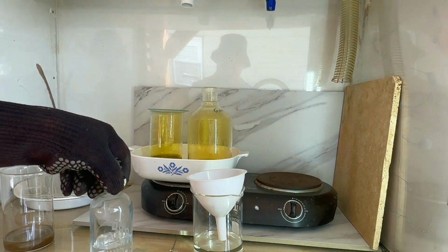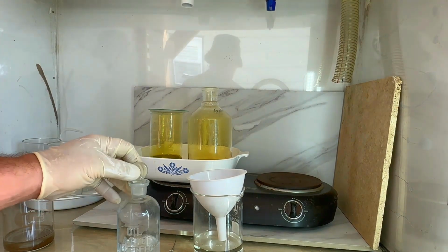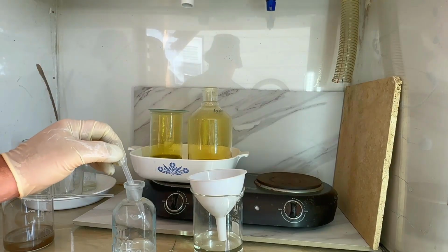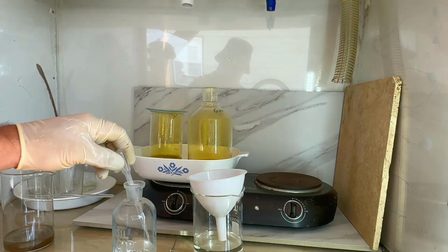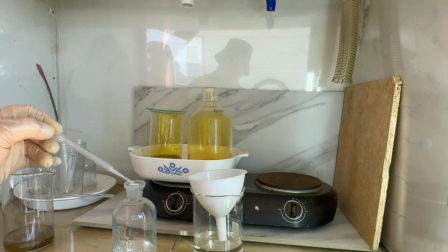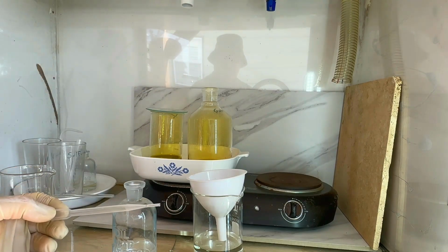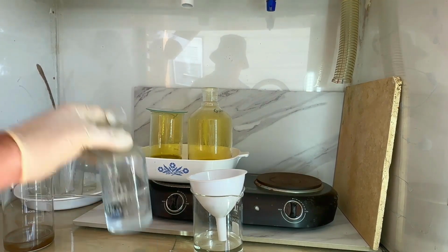All right, we're going to grab some nitric here. We still have a fair amount of solids in our Aqua Regia on the burner. We're going to give a little more nitric, see if we can't get them to go into solution. We still have a fair amount of fumes, but it's slowed down significantly from when it started, and clearly there's some more solids to be dissolved. So give that a little bit more.